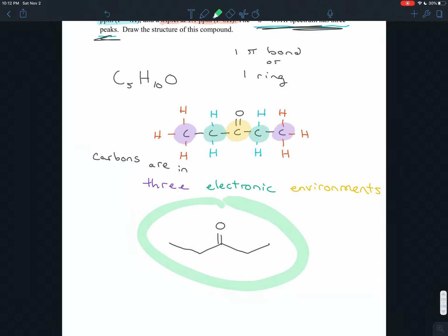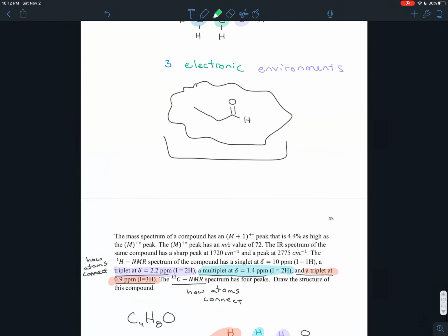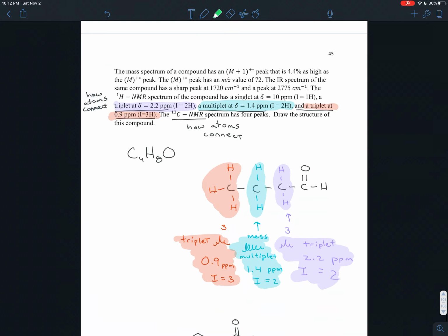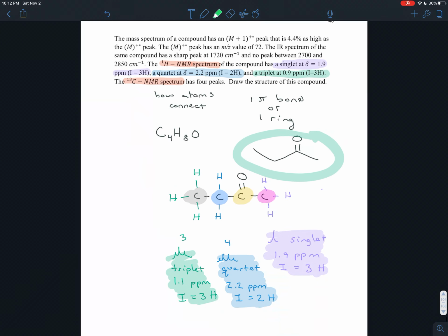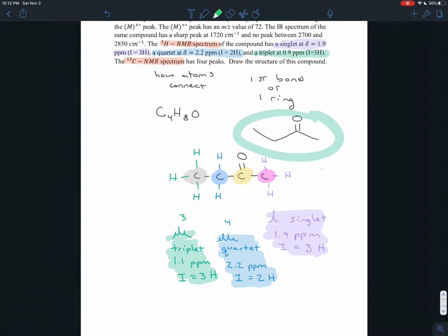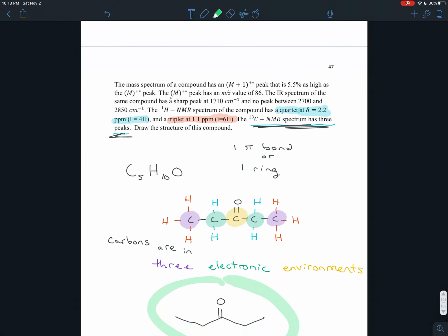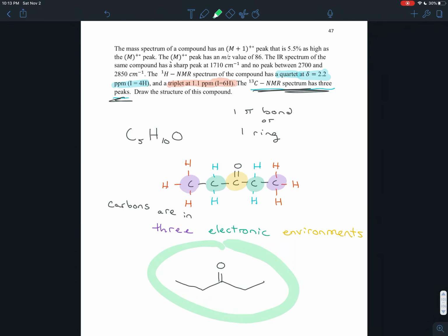So in this video, we have piggybacked off of our discussion of the aldehyde spectroscopy. We went into a little more detail there about the techniques behind these numbers. In this video, we've just used the numbers, assuming that we covered the concepts behind them in the previous one. So we used the numbers to verify and to elucidate these ketones.